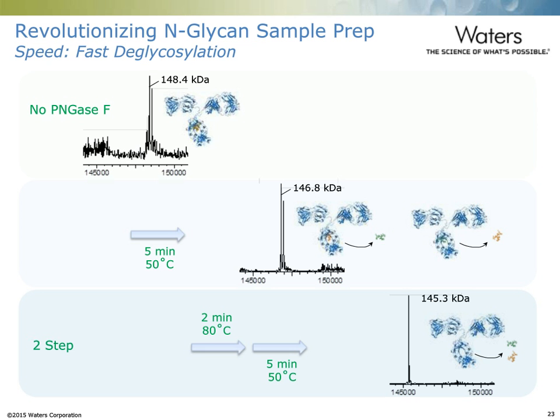Mass spectrometric detection confirms that these samples present different states of glycan occupancy. The control sample contains the mAb in its doubly glycosylated native form. Once incubated for deglycosylation, this mAb predominantly presented molecular weights indicative of loss of one glycan. In contrast, however, the sample subjected to our proposed rapid deglycosylation protocol is represented by a single mass that is in agreement with the molecular weight predicted for the mAb after a complete loss of both N-glycans. In addition to releasing Fc domain glycans as shown in this example, it has been confirmed that the rapid deglycosylation approach produces complete release of Fab domain glycans, as has been evidenced by a comparison of cetuximab subunit glycan information versus a RapiFluor-MS-derived N-glycan profile.